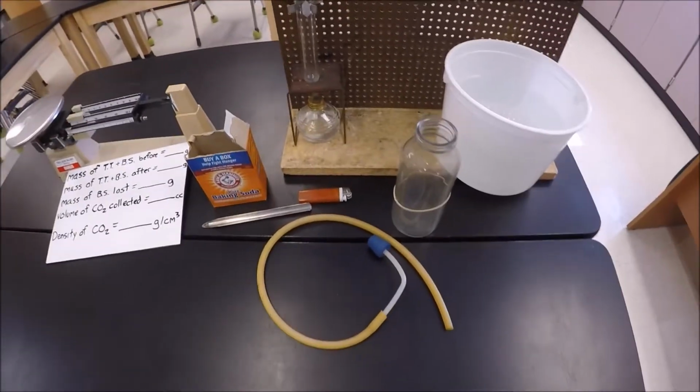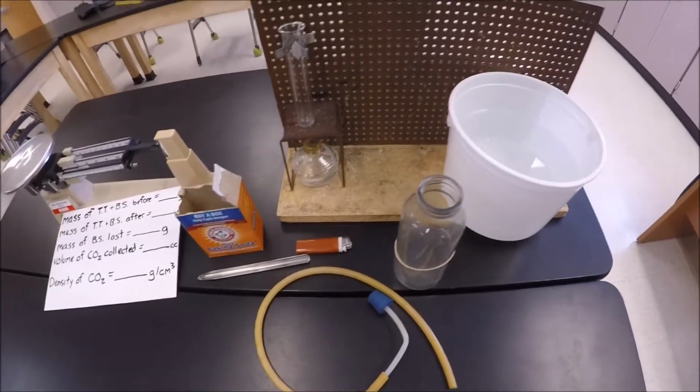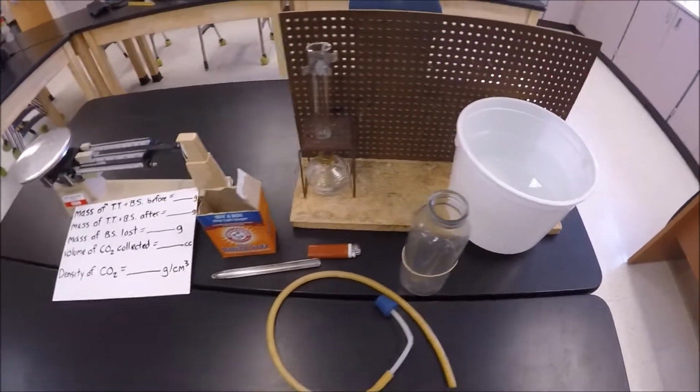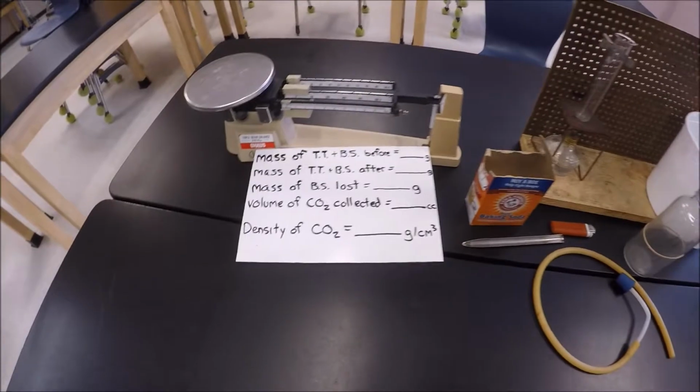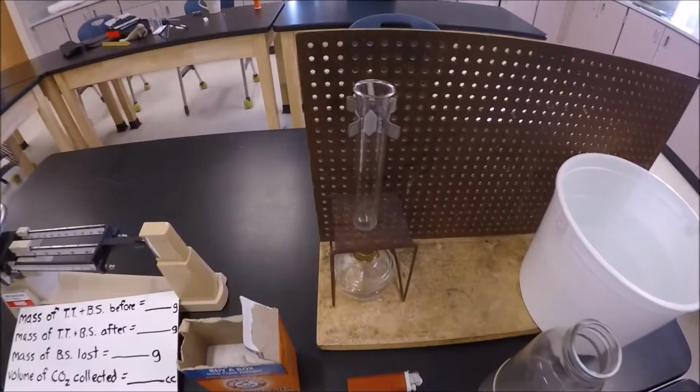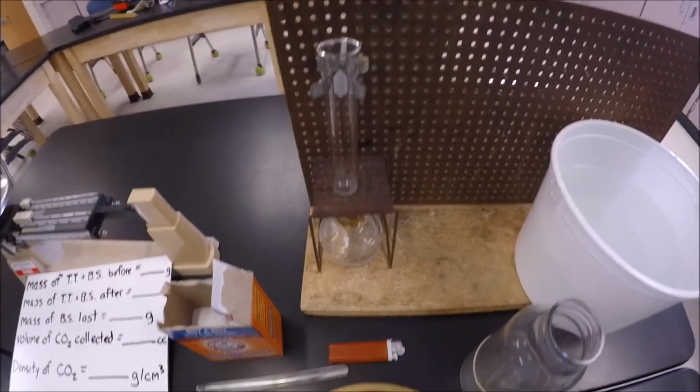Okay, today we're going to do a pretty cool experiment here. We're going to basically figure out the density of carbon dioxide. So if you look, I've got some basic lab equipment set out in front of us here. We have a pegboard, we have a test tube, we got a little clamp.